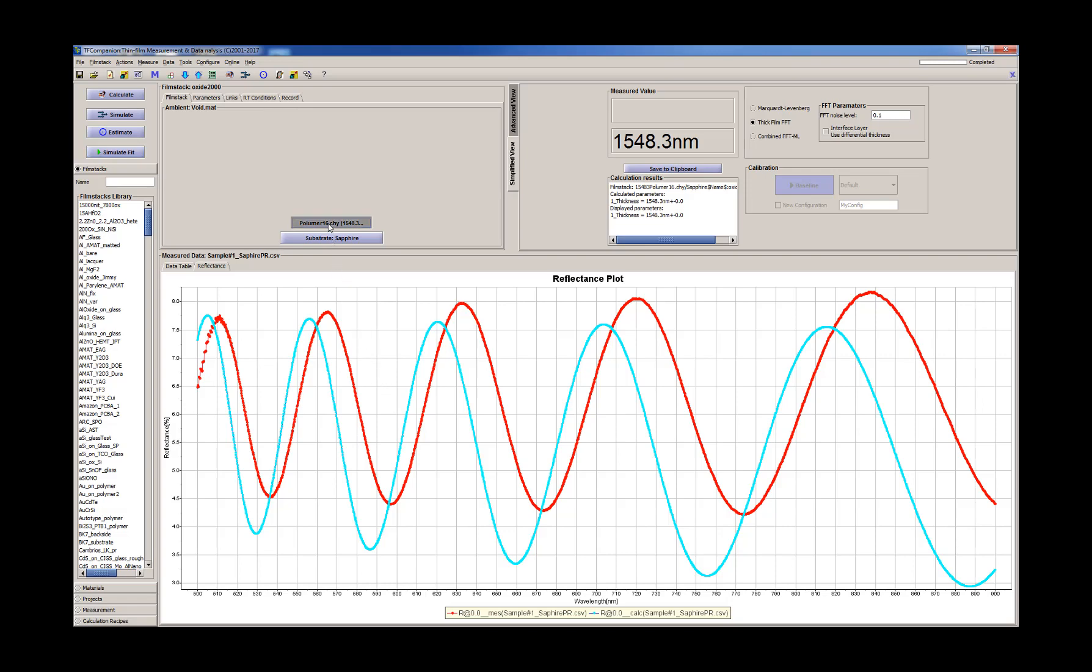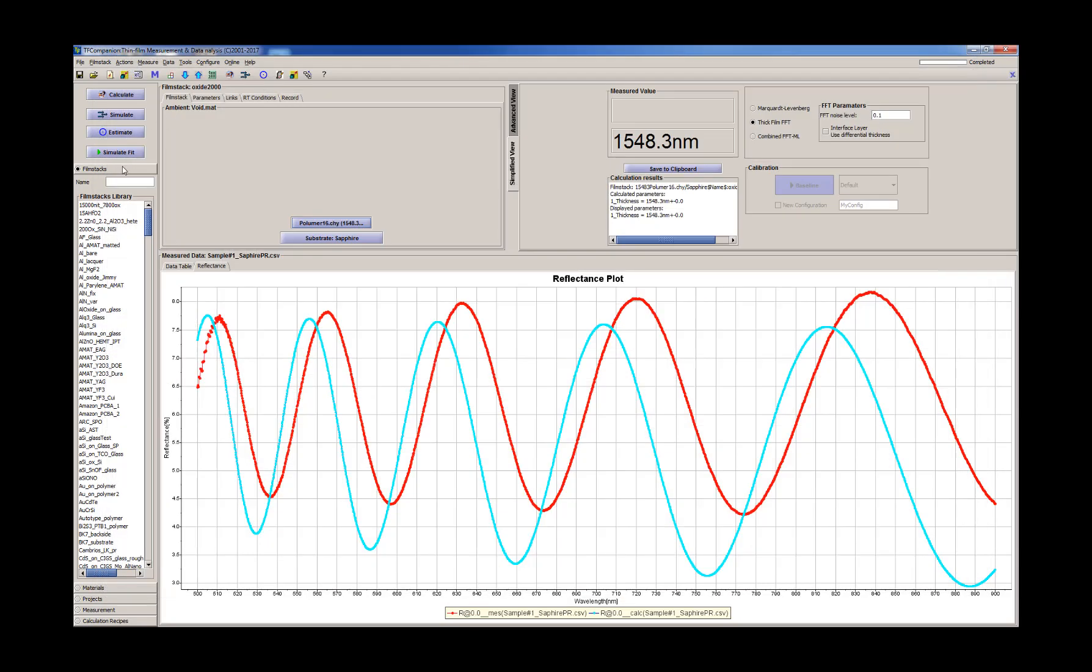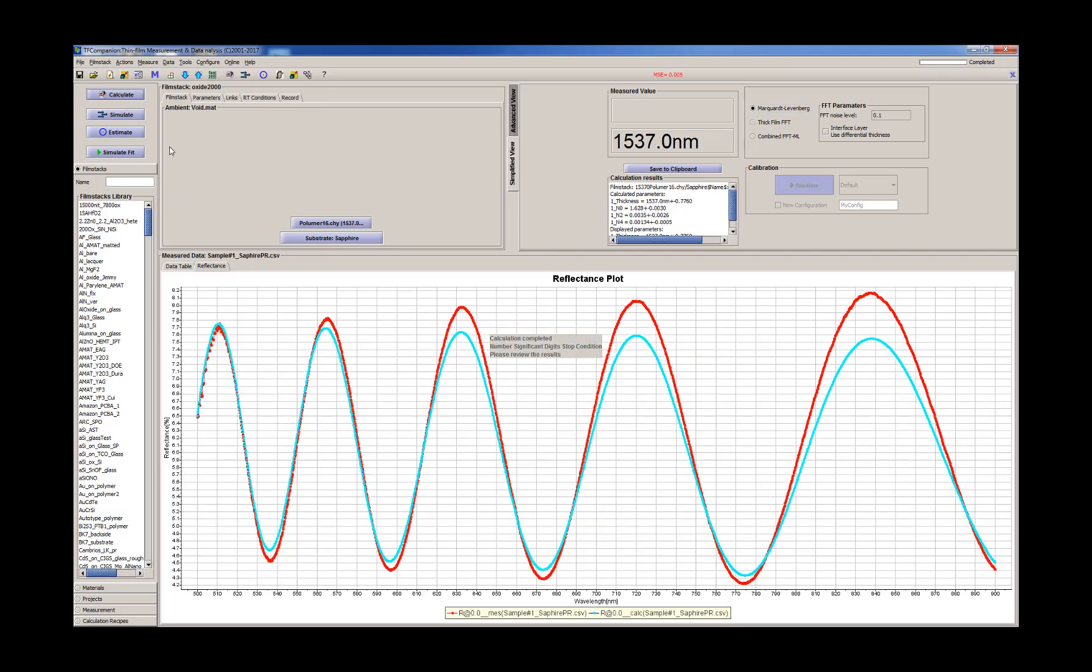So what we'll do is adjust the Cauchy coefficient, that means we'll adjust the refractive index optical constants of this layer to match the photoresist. So for that we'll use Marquardt film fitting. Okay, so the fit is much better.